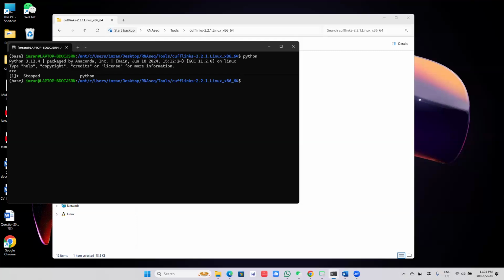Okay, let's see. Just write sudo apt-get install Python 2. Enter.